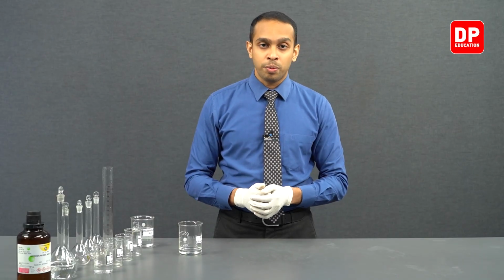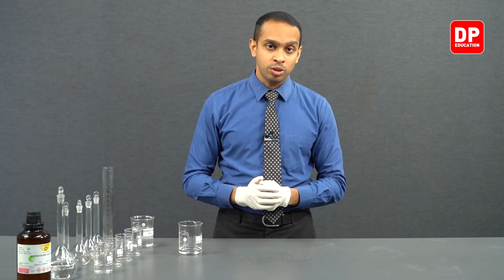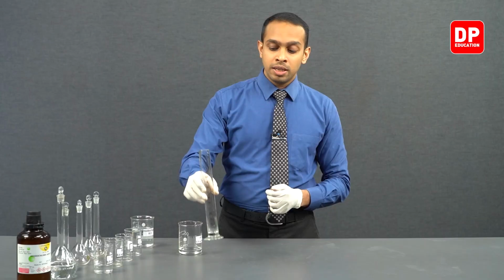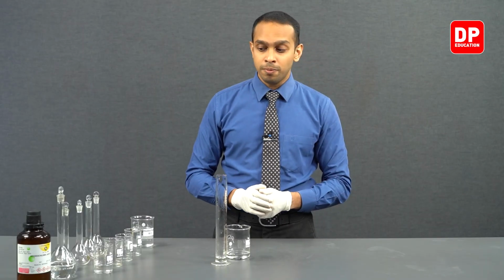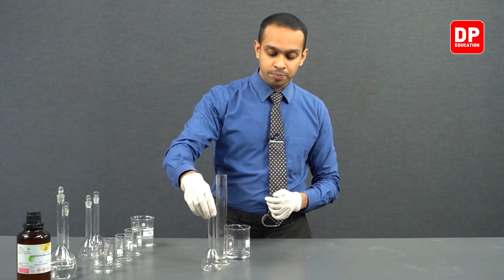We can move on to preparing our 0.6 mole per decimeter cubed concentrated HCl. In order to do that, we'll have to measure 60 milliliters of 1 mole per decimeter cubed concentrated HCl and transfer it into a volumetric flask.